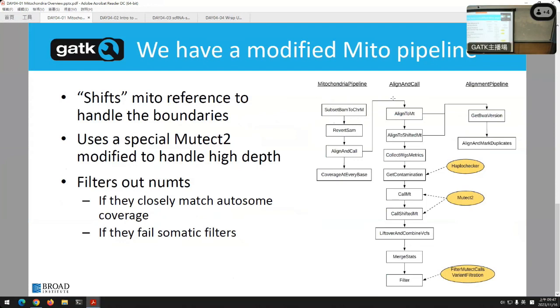The sequencing errors are no longer a trivial fraction. They become significant. And that makes it very difficult when we're trying to go in and align things and reconstruct the graphs. You get crazy graphs if you aren't careful, because there's a lot of noise in there all of a sudden. Just that amount of reads means that errors pile up. You start getting these noisy graphs. So there is some tweaking we also had to do to Mutect2 to be able to handle that.